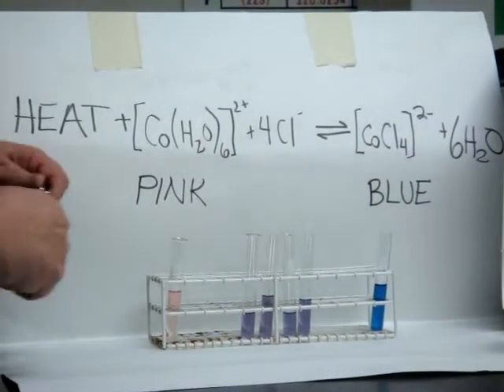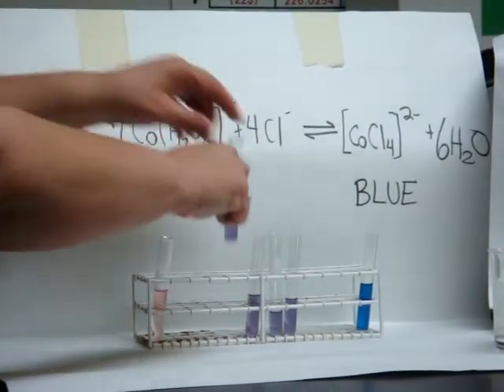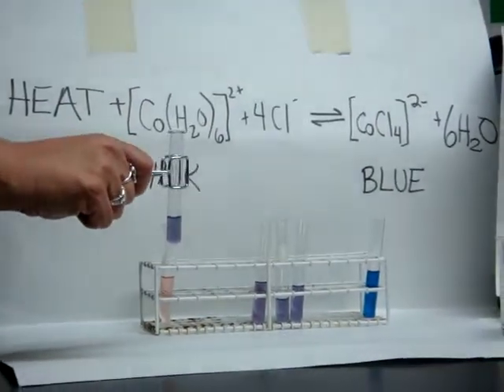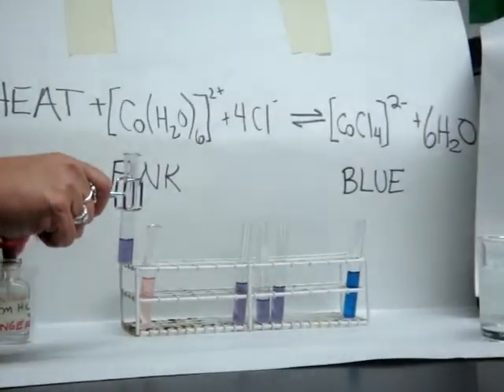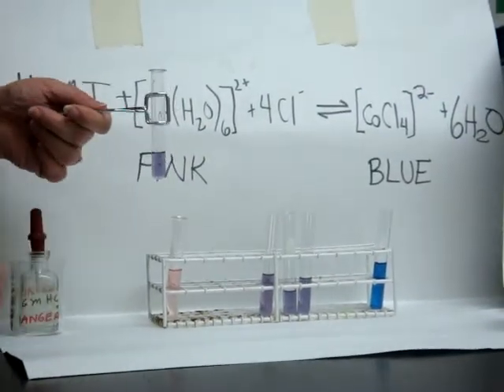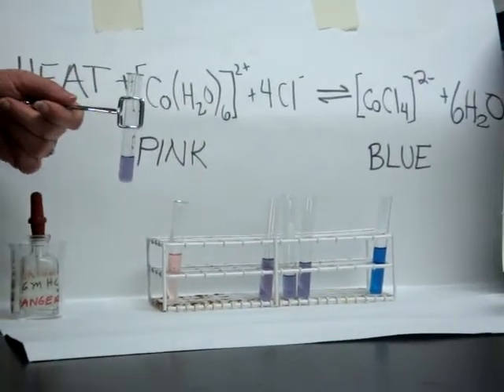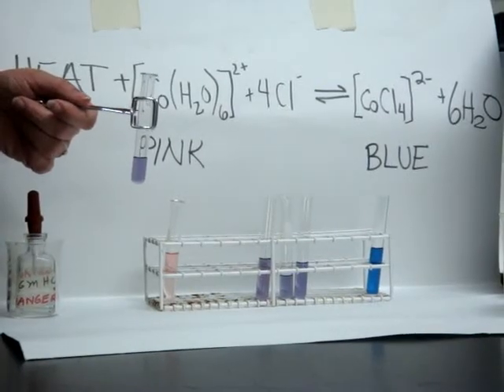So the first shift I'm going to try, I'll take my test tube and I'm going to add some concentrated acid, some HCl. So what do you think is going to happen? On your paper there's a place to make a prediction, so make your prediction.